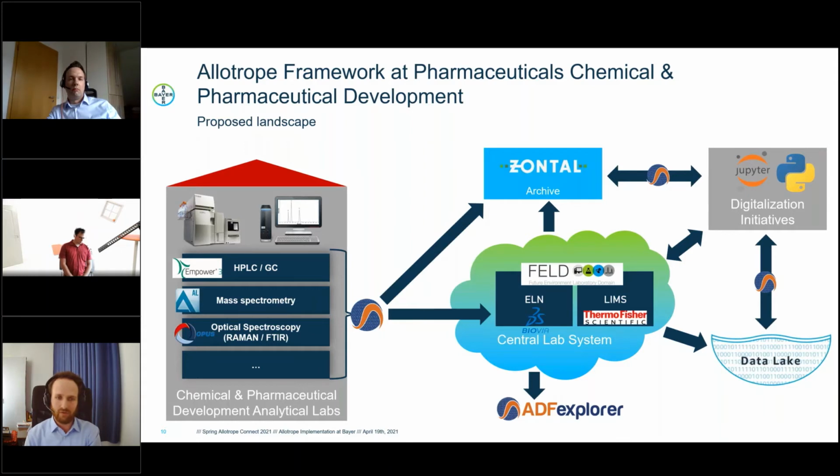And therefore, ADF is pretty helpful if you're just in the LIMS and then open the respective ADFs, and then you don't need to go to all those three source systems where you might have data from, or even more. You only have a central storage of all those files, and you're able to at least have a sufficient insight into what has happened there.